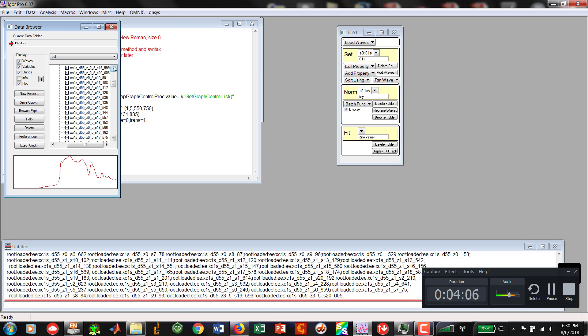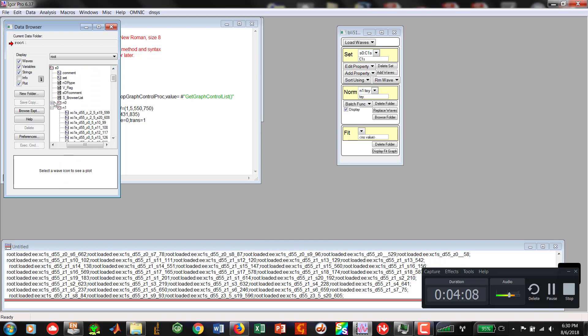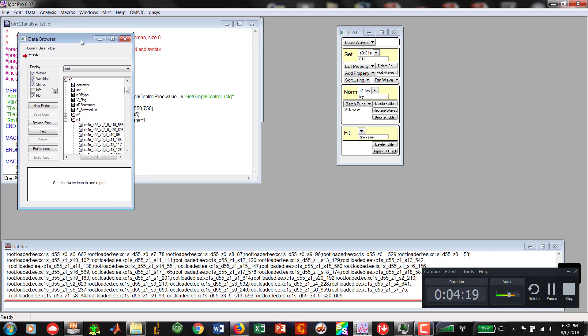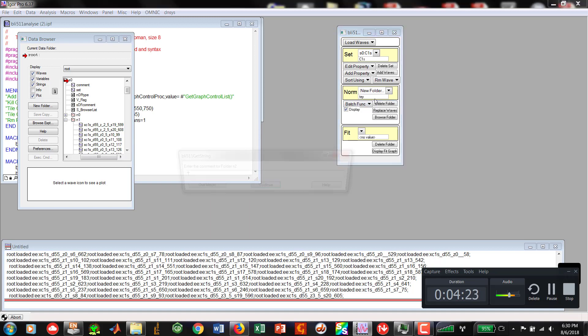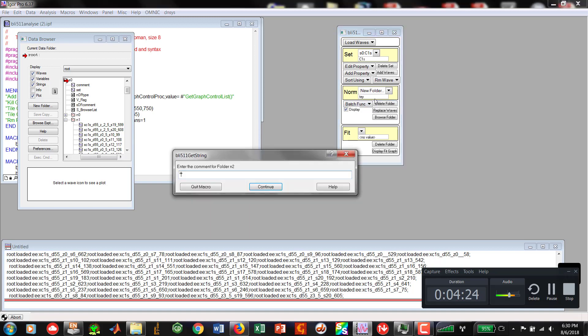We go up to N0. OK, I'm going to minimize that. OK, it doesn't like that. Anyway, we'll go over and then make our new folder where we're going to do our interpolation.